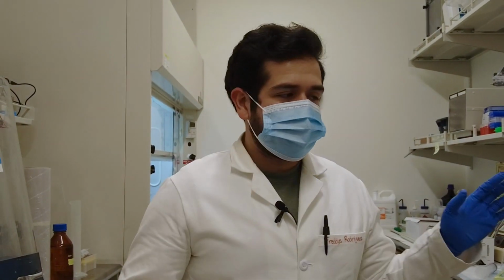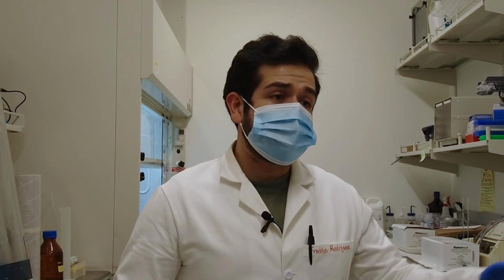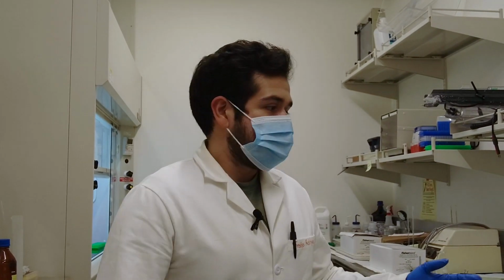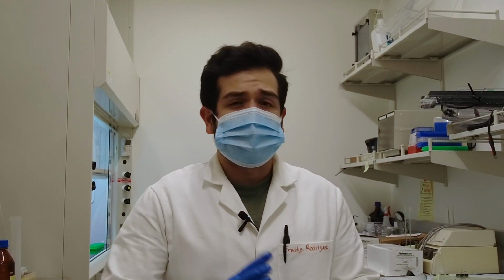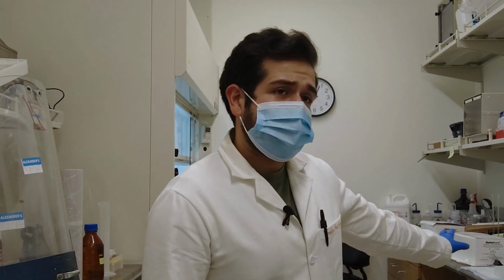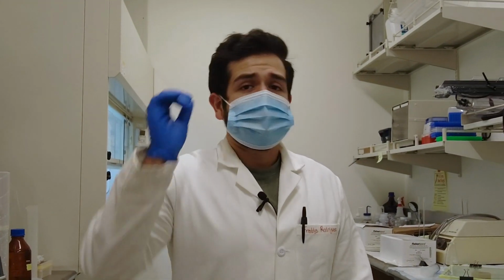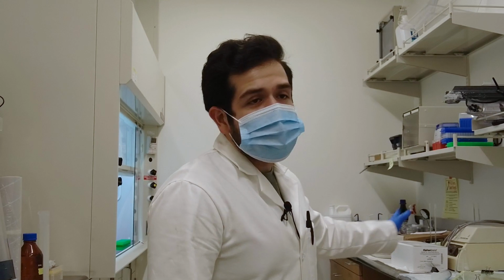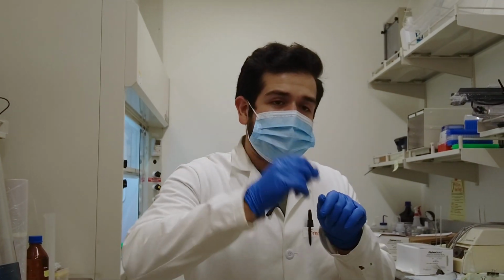Once you have finished setting up your gel, aside from getting your samples ready, the other thing I recommend is to clean up your workspace. Setting up these radioactive gel assays can get really hectic really quickly, and you will have all sorts of things lying around. So try to clean up your space as much as possible in between steps that have some time in between. For example, the only thing I have left next to my gel is the Erlenmeyer flask that still has some of the PAGE gel solution, just to watch for it to polymerize, because once it has polymerized, the gel's done. That syringe, I'm just keeping over there to remind myself that I need to clean it out.